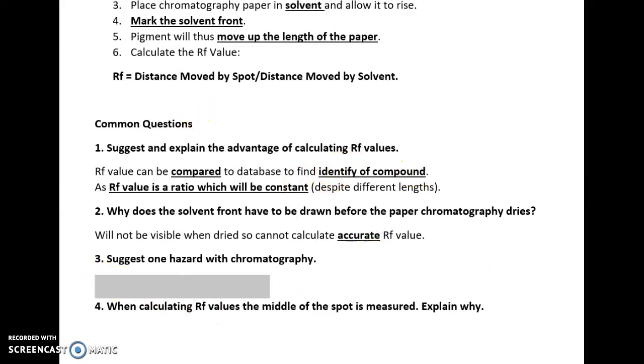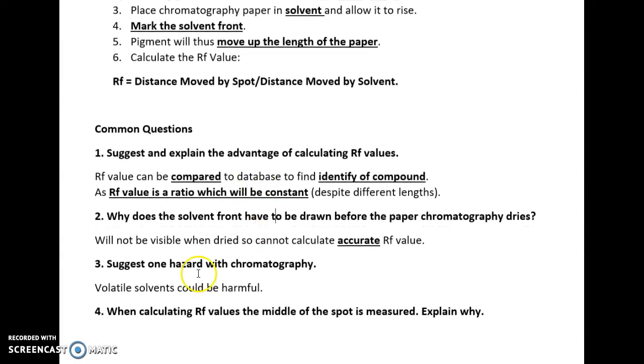A hazard involving chromatography is the use of the solvent. Solvents can be harmful, so you should work in a well-ventilated environment, not leave it on the edge of work benches, wear gloves and handle with care because it could be corrosive or irritative.